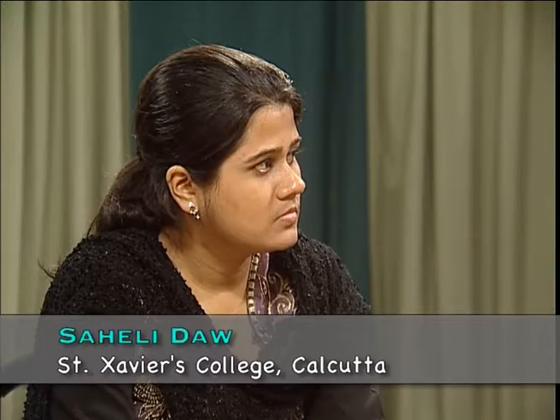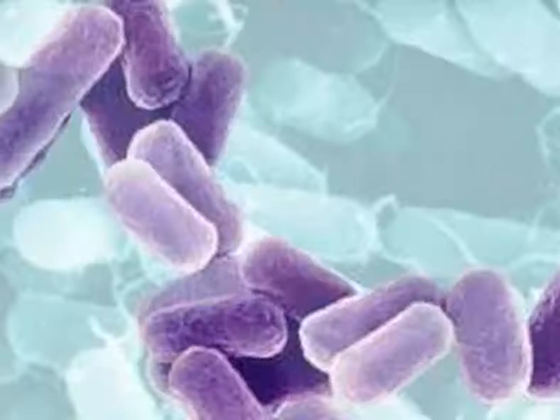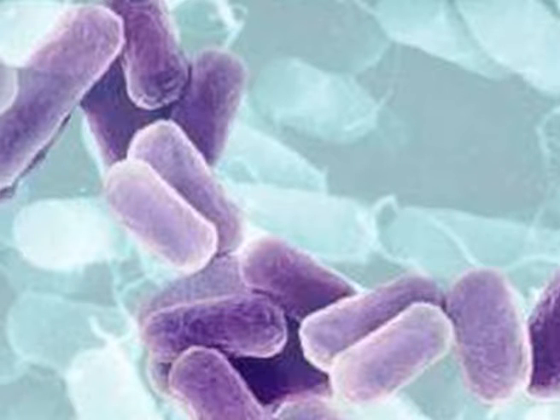The kind of elements which is added to the culture medium depends upon the kind of bacteria which we want to grow. Generally, the bacteriological culture medium is a mixture of natural and synthetic compounds mixed in a fixed ratio, which is needed for the growth and development of the bacteria under lab conditions. It's generally made up of microelements, macroelements, trace elements, and vitamins.